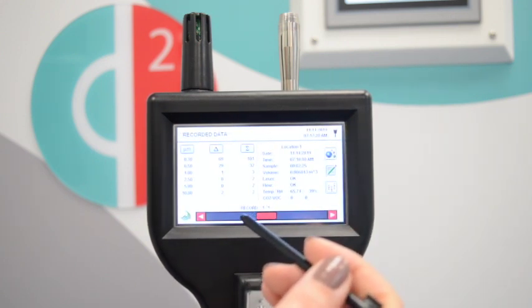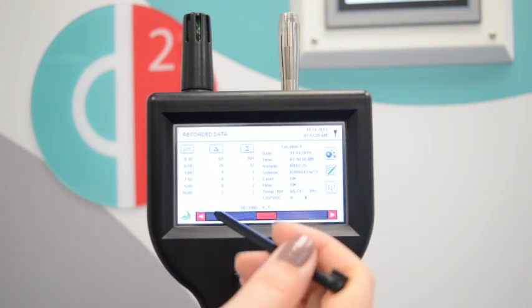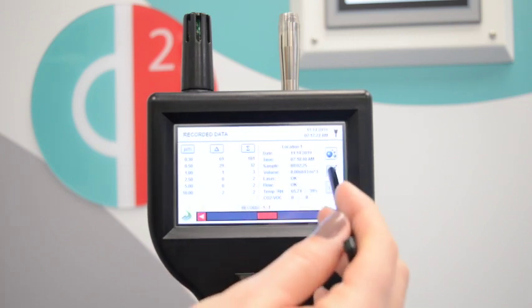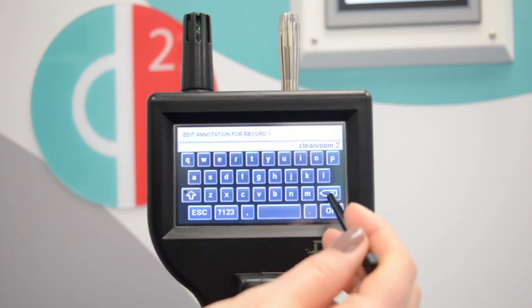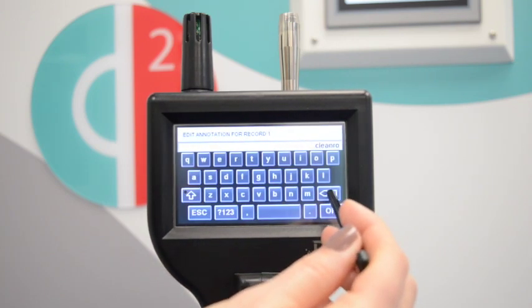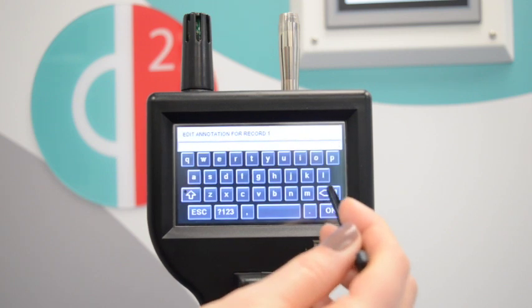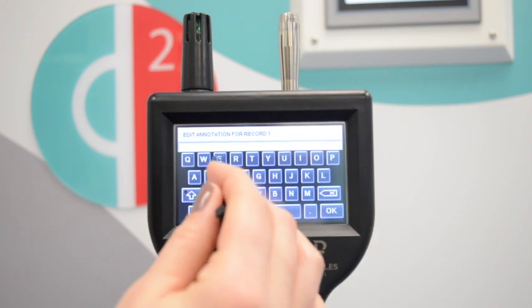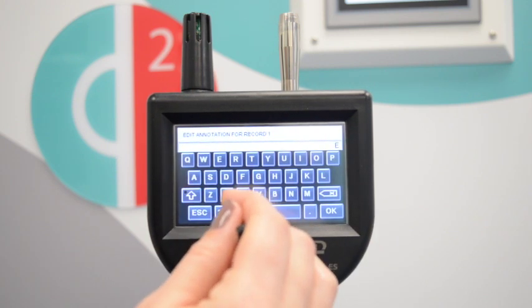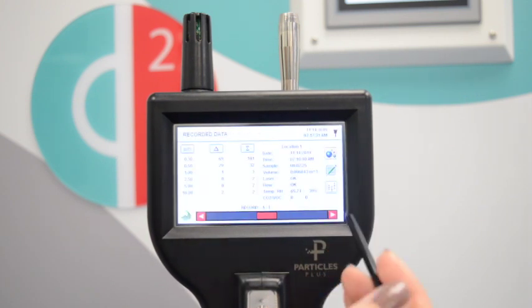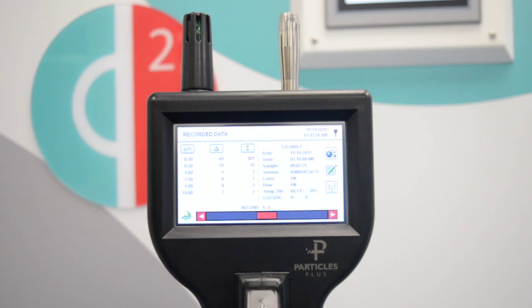If you put an annotation of EX, then it shows you want to exclude the data from the report. You are only allowed one exclusion per report or it will produce a fail to protect the integrity of the test.